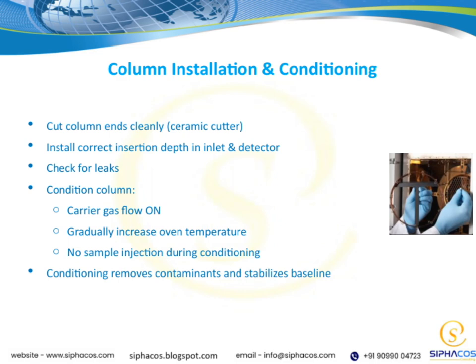After installation, always check for leaks. Even small leaks can significantly affect your analysis, so take the time to verify everything is sealed properly.